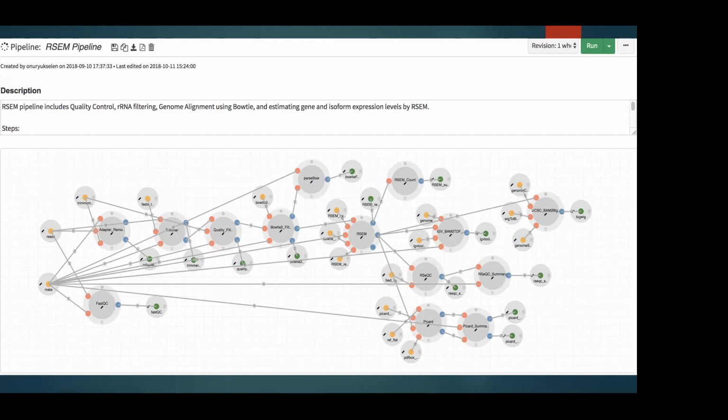I really forgot that I did this on DolphinNext, because DolphinNext was brand new at that time. I thought that this was before DolphinNext, but I realized that this was my first pipeline that I created in DolphinNext. I saw that and just changed the files, reran the pipeline and got the results without doing anything. And then I just shared the results.